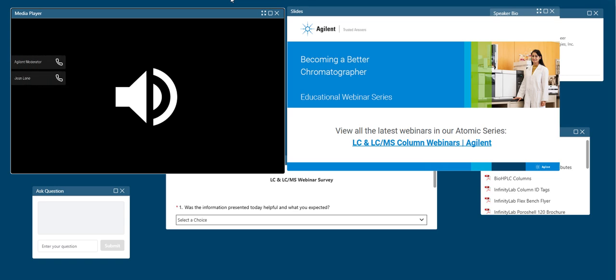Thank you. The next question is asking, does each column require special standards, or would multi-angle light scattering detection reduce the need for standards? If people are going to be working with multi-detection and light scattering detectors, they don't necessarily need to, because they will be working with the light scattering detectors.